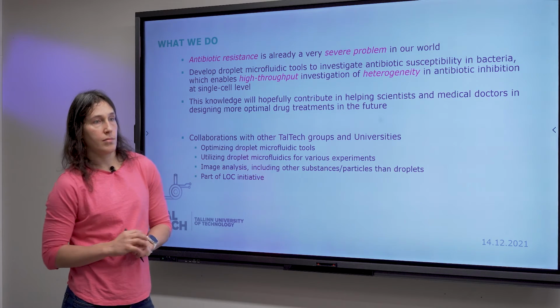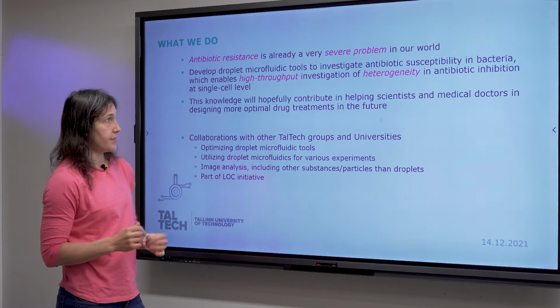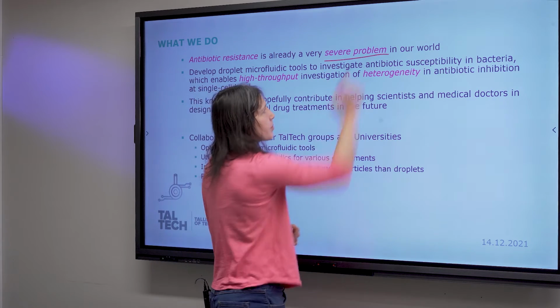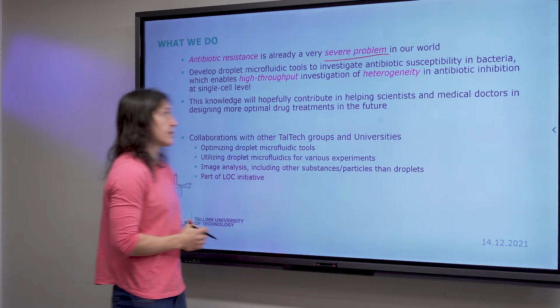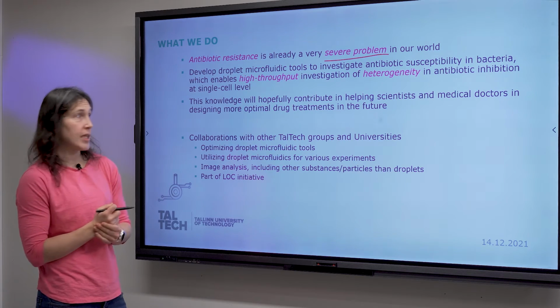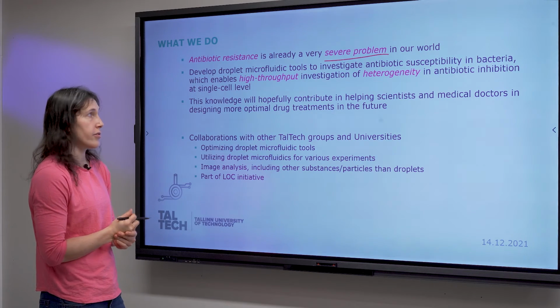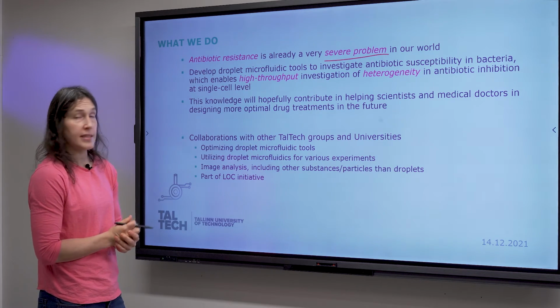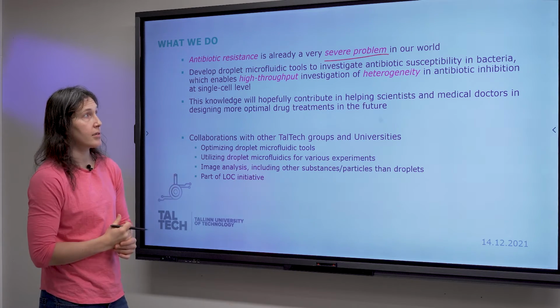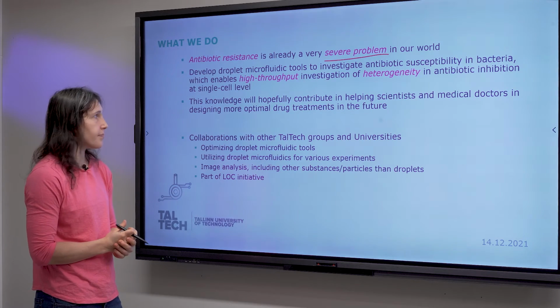As I mentioned, this resistance is a very, and I mean very, severe problem. But we have developed a microfluidics tool to investigate the antibiotic susceptibility in bacteria.